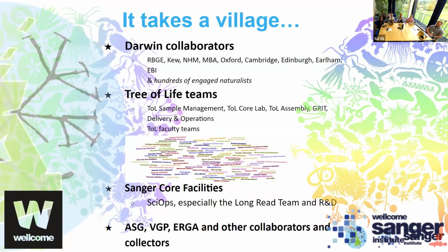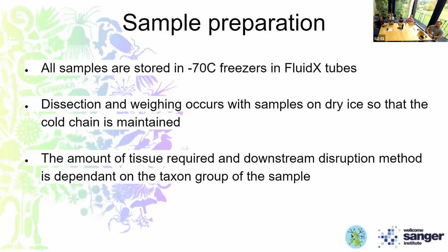So next we'll start with our pipeline, starting with the sample prep. Each member of the team will have a go at walking you through what we do in the lab. The first step of that is sample preparation, and for that I will hand over to Franco.